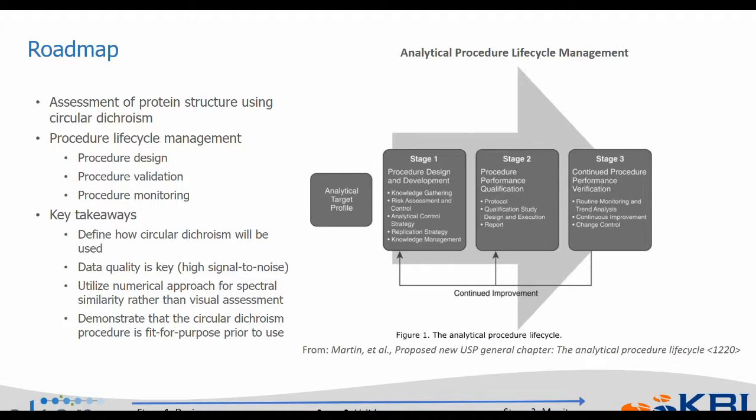As I discuss the life cycle management approach for circular dichroism, there are a few key takeaways from this presentation. I'll mention them up front here, and then I'll revisit each of these key takeaways as we go through the presentation. First, it's important that we define how the circular dichroism procedure will be used. As I stated before, my focus today will be on using circular dichroism for similarity assessments, where the goal is to demonstrate whether or not two materials are similar to each other. It can be used for other purposes.